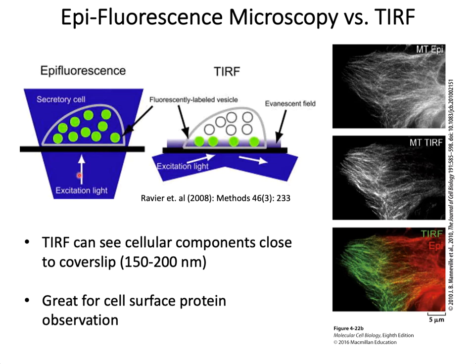The leftmost figure shows epifluorescence, which is regular fluorescence microscopy, where the whole thickness of the specimen is illuminated by the blue light, which is the excitation light. So all the fluorescent-labeled vesicles will be excited and emit the green emission wavelength. Due to this, the depth information can't be collected, meaning you can't distinguish which vesicle is close to the cover slip and which is distant. All will appear as a two-dimensional image, as if they are all at the same plane or depth.